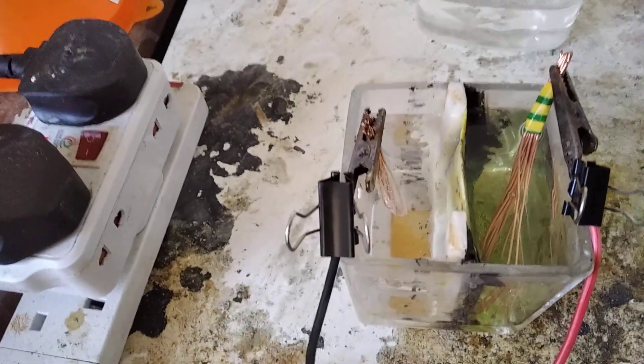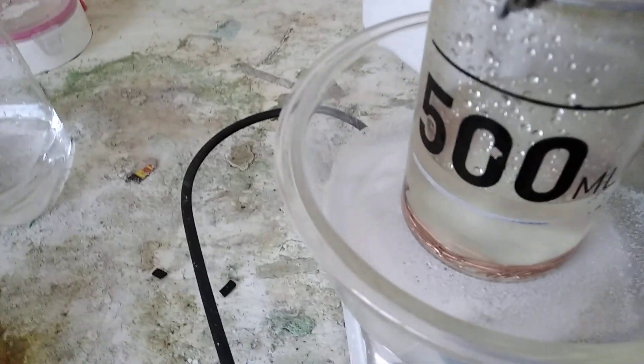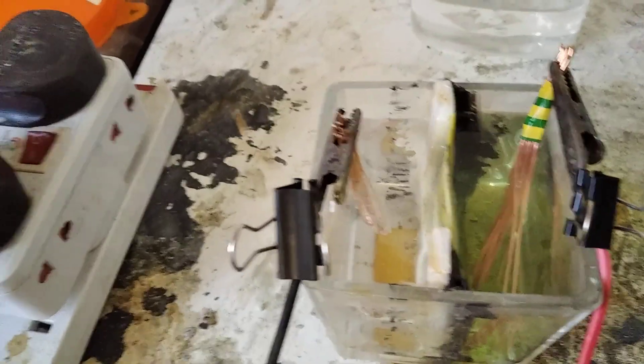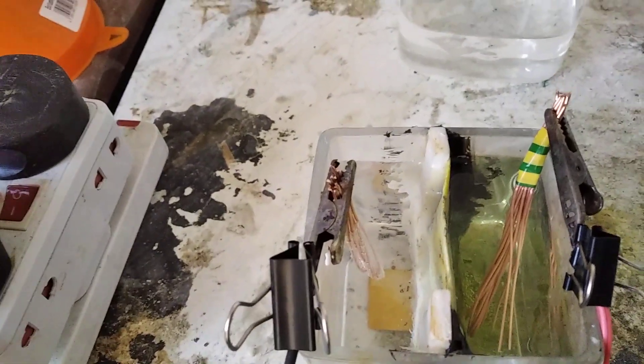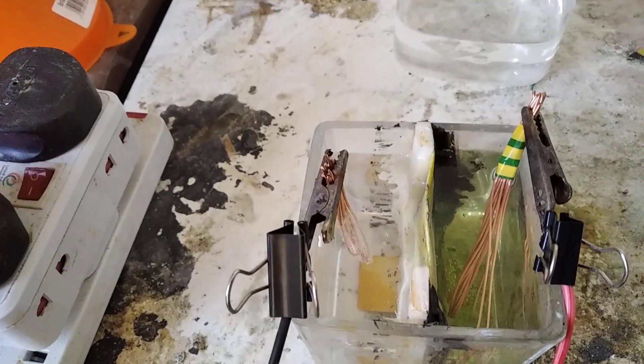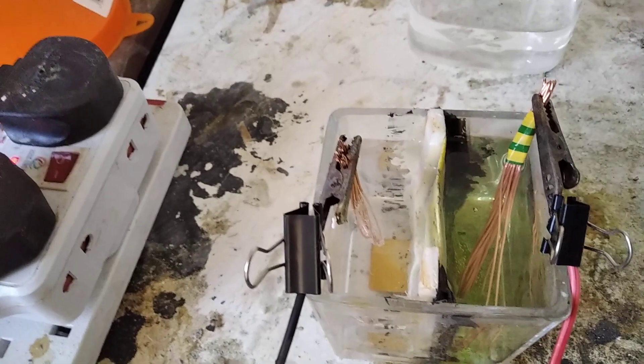By the looks of it there's already a clear winner, because this has been running for more than 30 minutes, whereas this one I've only turned on about three minutes ago. So yeah, membrane electrolysis — seriously guys, try it, you will like it.